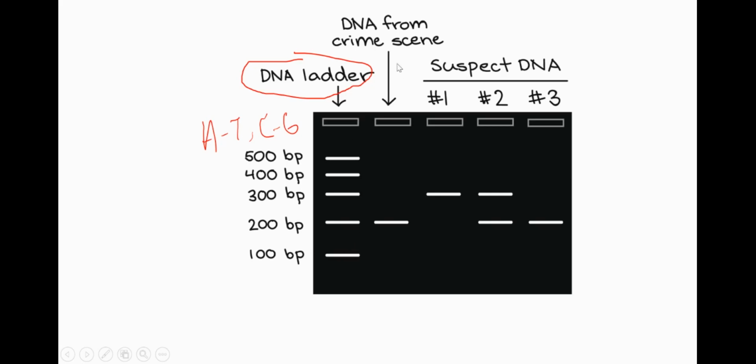All right, so now let's compare it over here. This is the one that we have from the DNA crime scene. All we have to do is match which suspect is an exact match to the one left at the crime scene. So if we look down over here, it's right here.